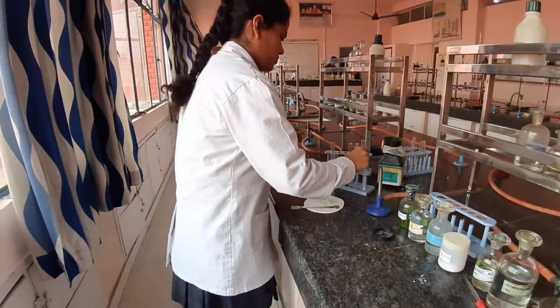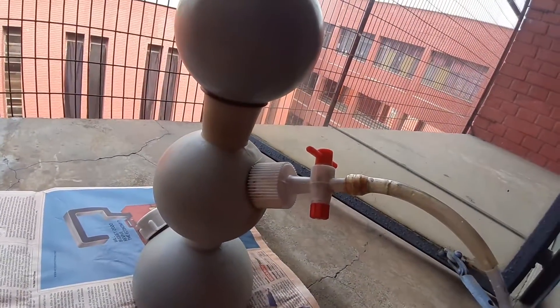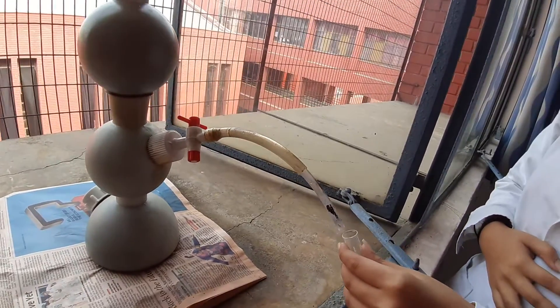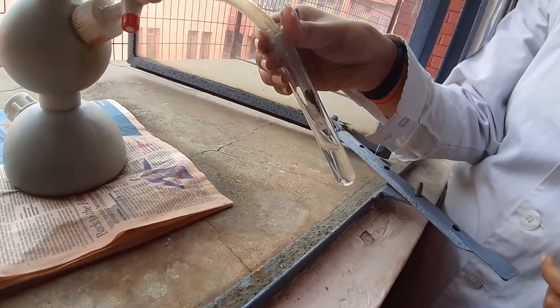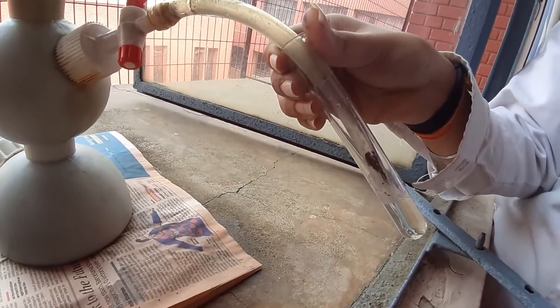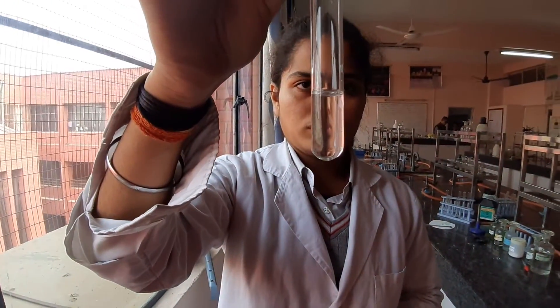Moving to group number 2. In the same test tube, you need to pass H2S gas in acidic medium. The H2S gas is prepared in an apparatus — you can see the knob is perpendicular to the tube, this is an off position. Nikita would be using this H2S in her test tube by putting the knob in the on position. The gas is being passed through the solution. No PPT — shows group number 2 is absent.